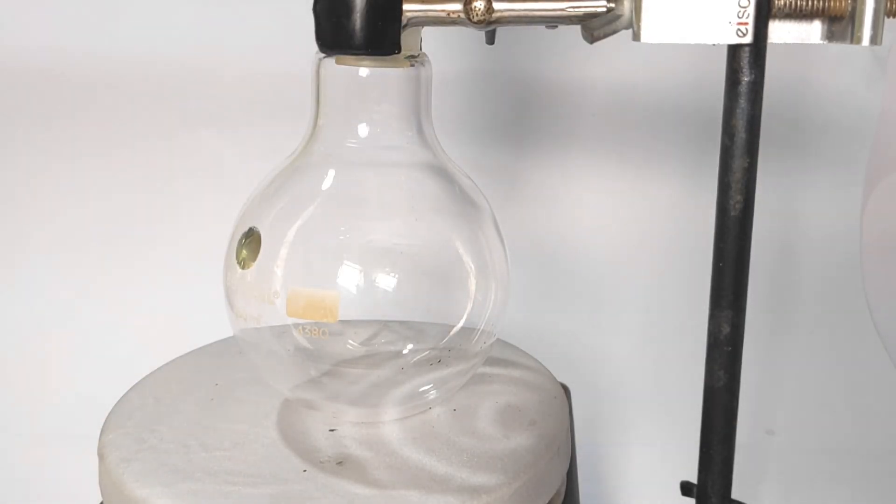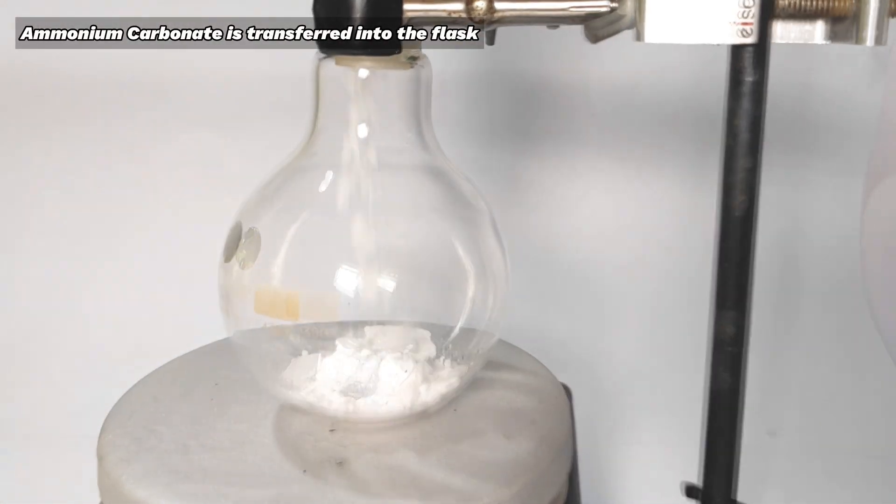A 250 milliliter round bottom flask was clamped on a stand over a hot plate stirrer and a stirring bar was placed inside. Now, 18 grams of ammonium carbonate was charged into the flask.